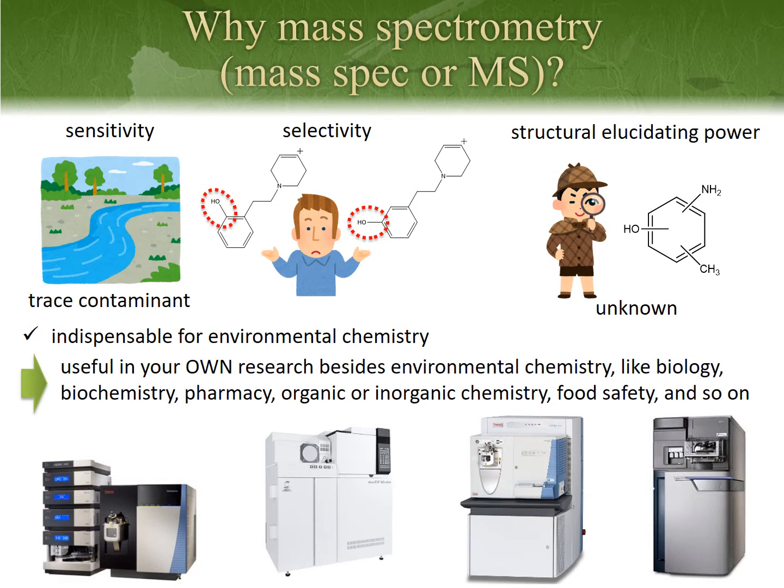Mass spec is the clipped word of mass spectrometry. Also, you can say it just MS. But please be careful not to say mass. MS is the abbreviation of mass spectrometry, so you have to say MS as its abbreviation.